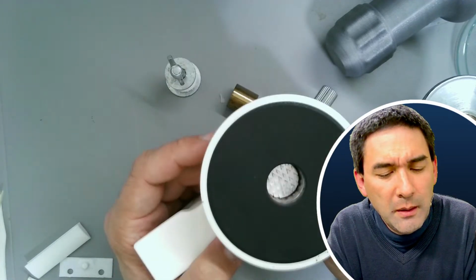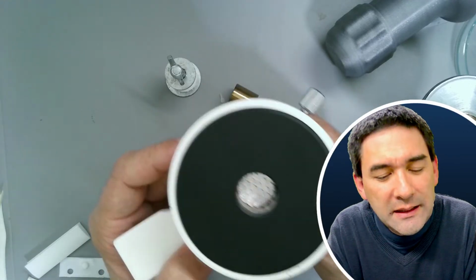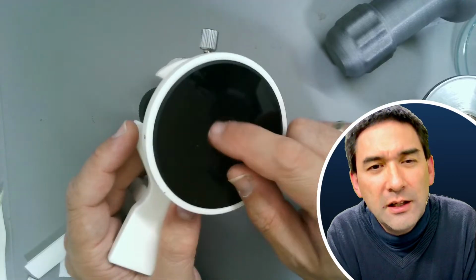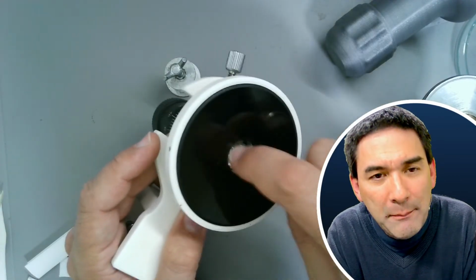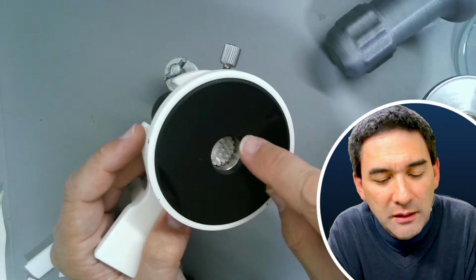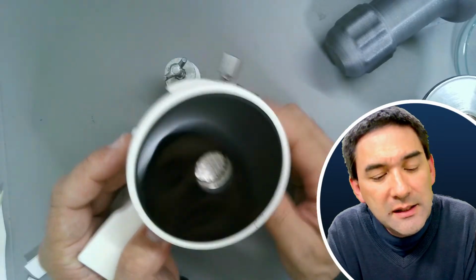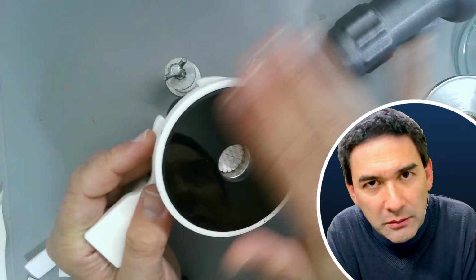But it also has a problem. Okay, not a problem really, but a slight disadvantage why I'm not using it. Essentially the specimen is not stable in here. There is no clamp on the inside. So if you put something in here, it's not clamped in, so it can be lifted out very easily. And this is a problem, especially if you want to make very reproducible cross sections.